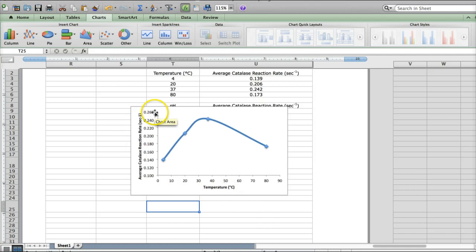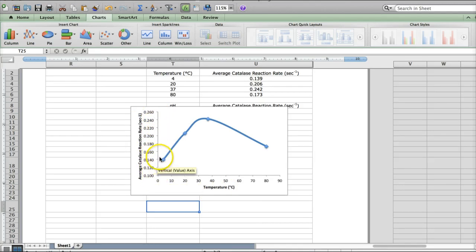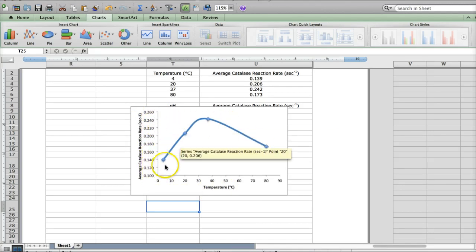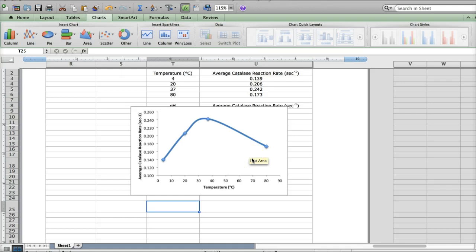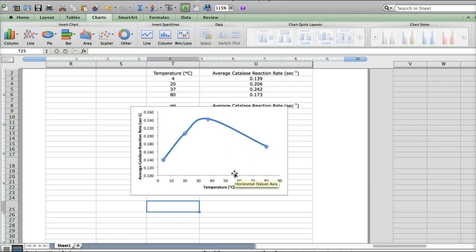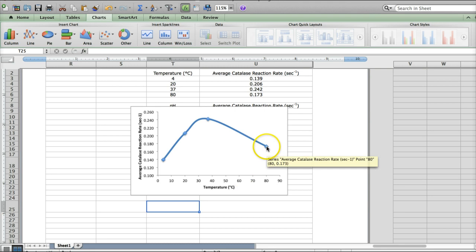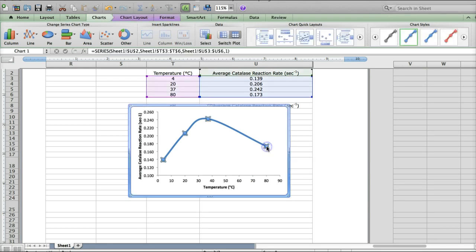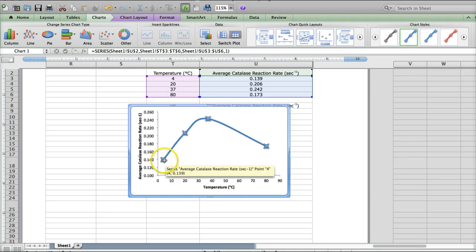I have the y-axis adjusted to be more in line with my data. The only thing I need to add in here are the standard deviation bars. So the standard deviation, remember, is in our table. And to create error bars, you just need to click on one of the data points, and it will select all of them.